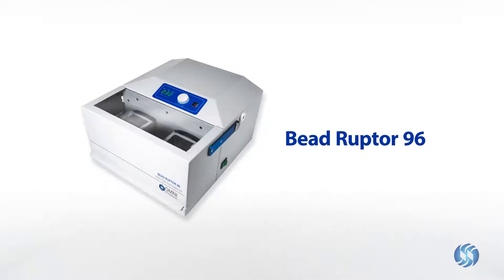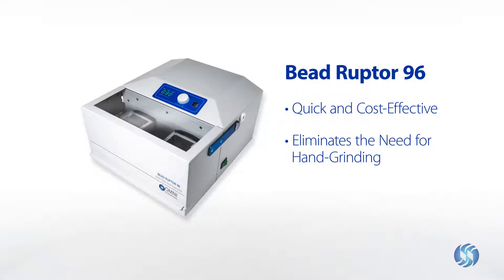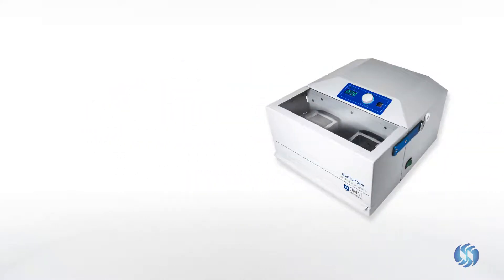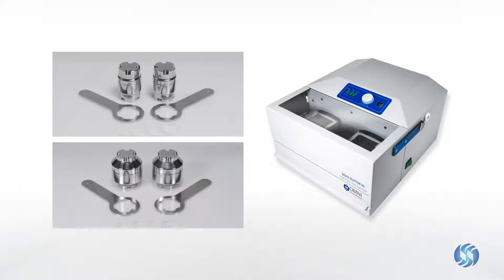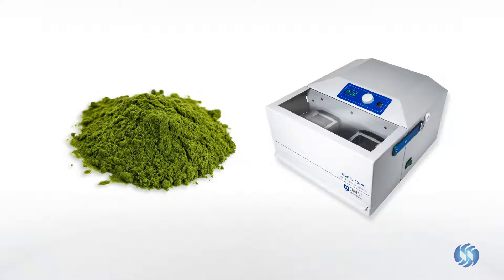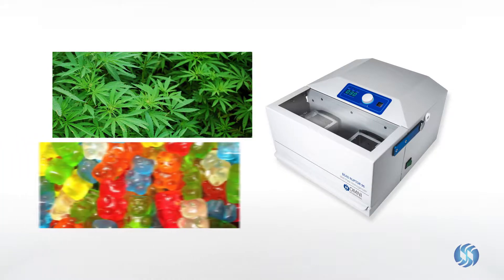The BeadRuptor 96 offers a quick and cost-effective approach, eliminating the need for hand grinding. The BeadRuptor 96 utilizes reusable grinding chambers which, when combined with a minimal amount of liquid nitrogen, can turn any sample into a fine powder, including plant materials and edibles.